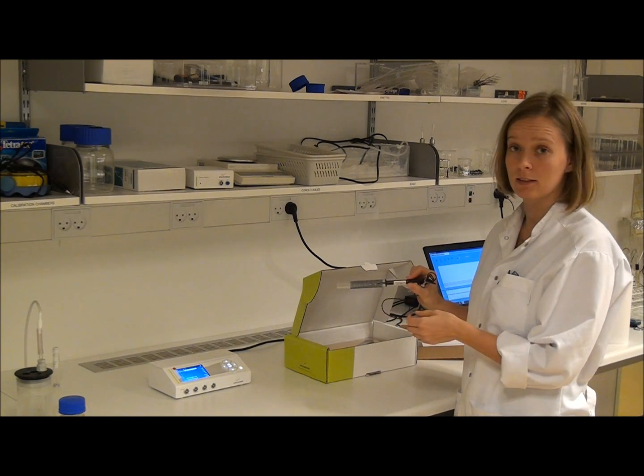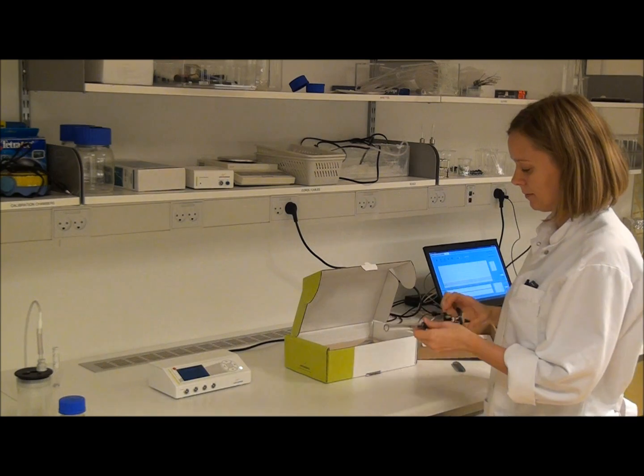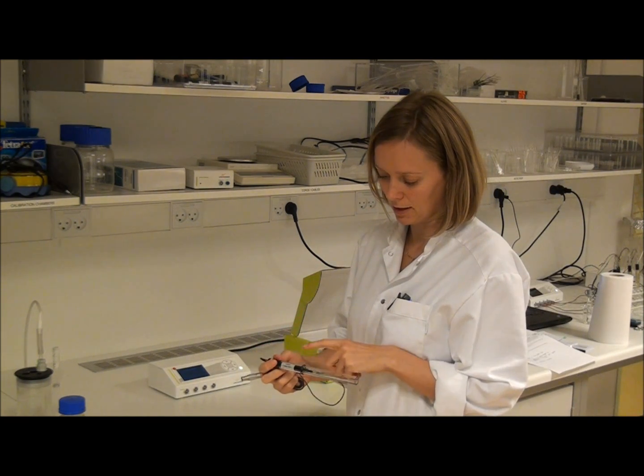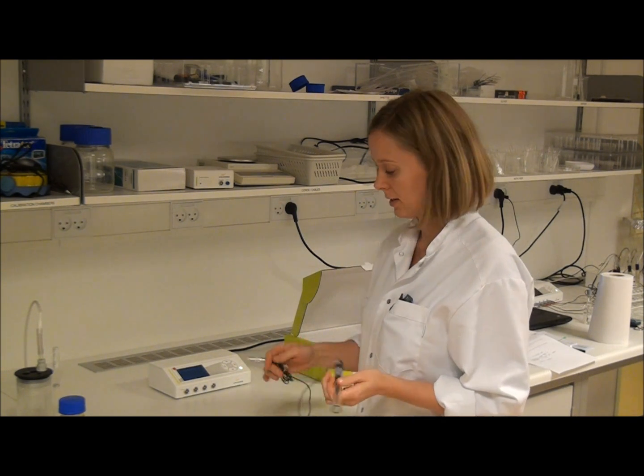The sensor also has a grey shock absorbing net, which you can take off. As you can see, the sensor has a protection tube and a white seal. Just leave the protection tube and the white seal on while testing the sensor.